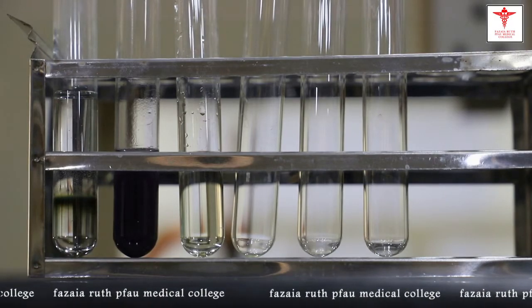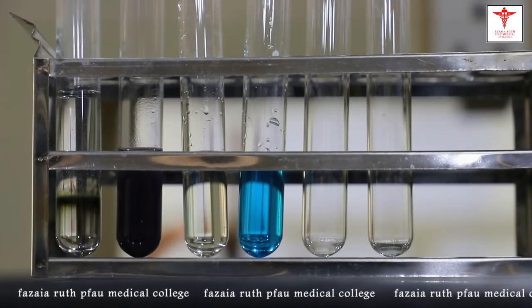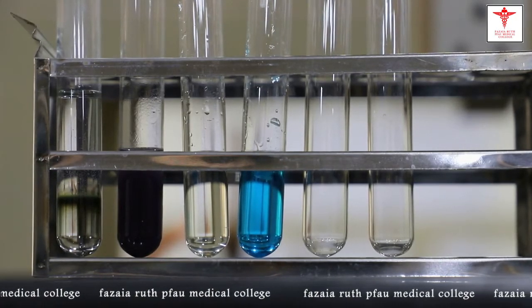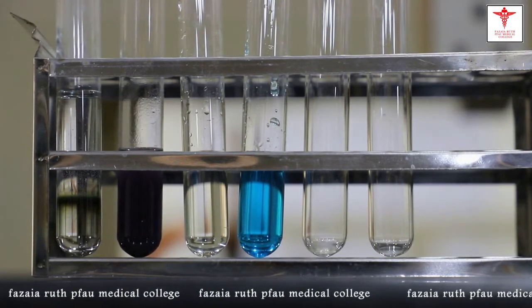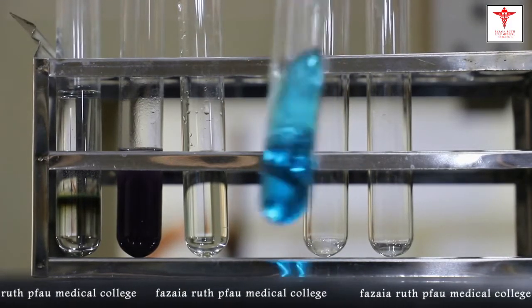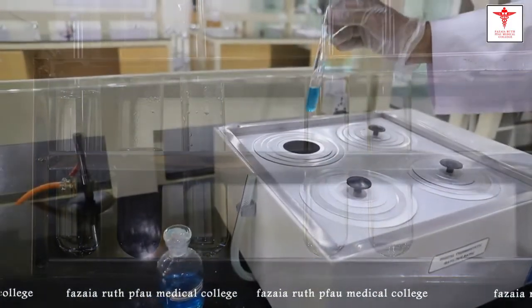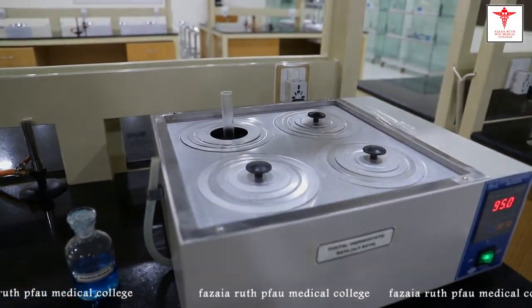We'll take 5 ml of Benedict's reagent and to this we'll add 8 drops of original solution. We'll now place this test tube in the water bath and heat it for 2 minutes. We'll boil it for 2 minutes.